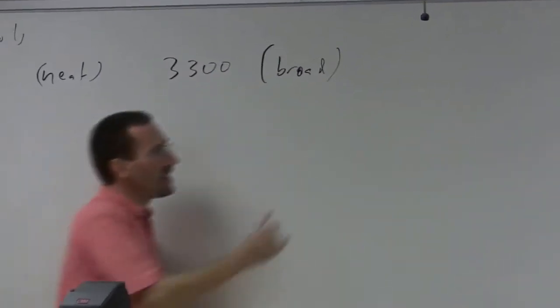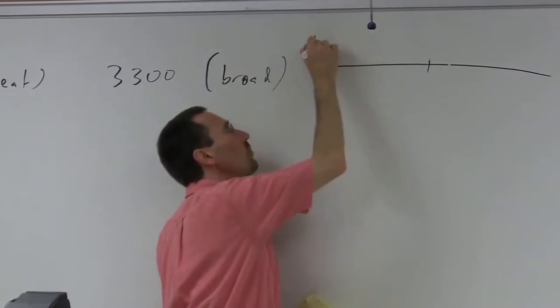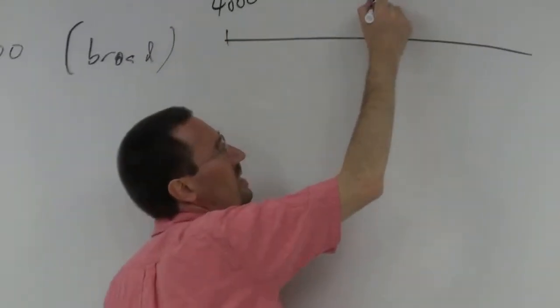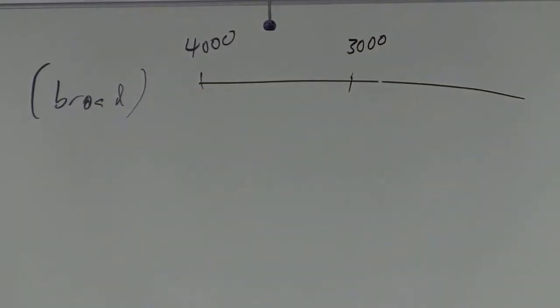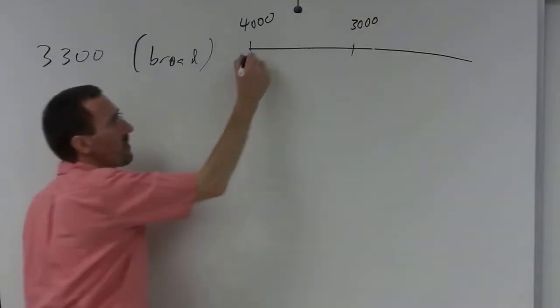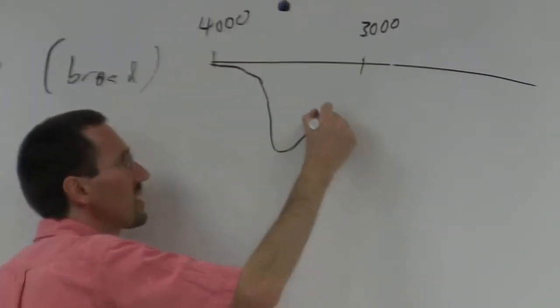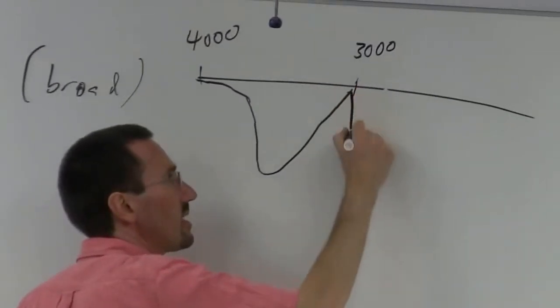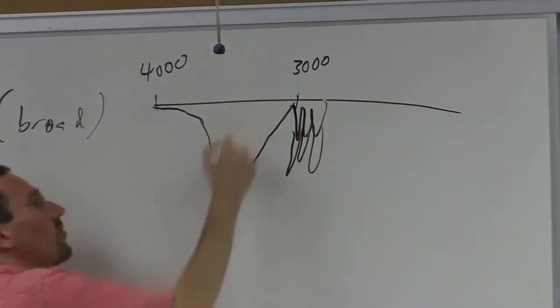It'll be broad. And on the pattern recognition, if I'm drawing these two points in my mind's eye, say the end of the spectrum at about 4000, I guess the examples I have here may run to 4600. What you're going to be seeing is a band that picks up at about 3600 and comes down maybe somewhere around 3000, and then of course you'll have some alkyl stuff over here.